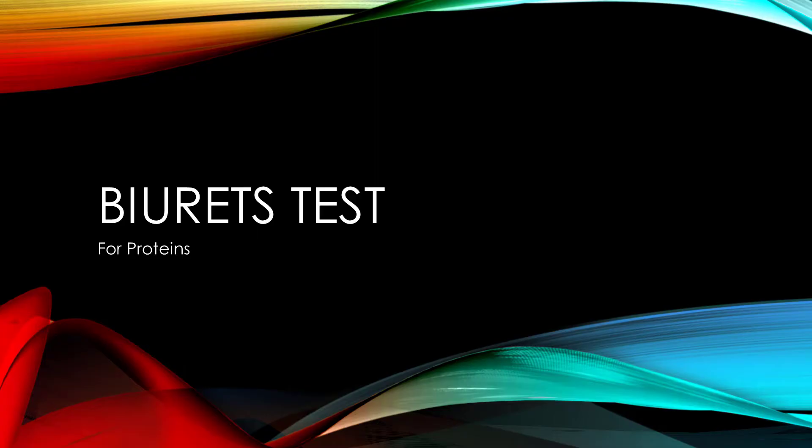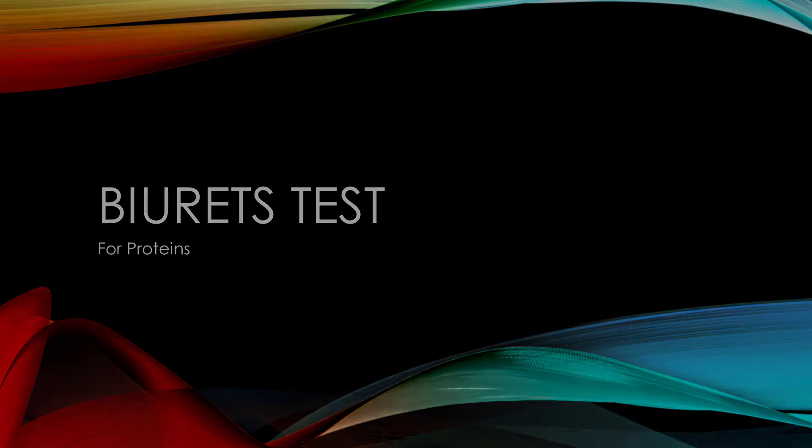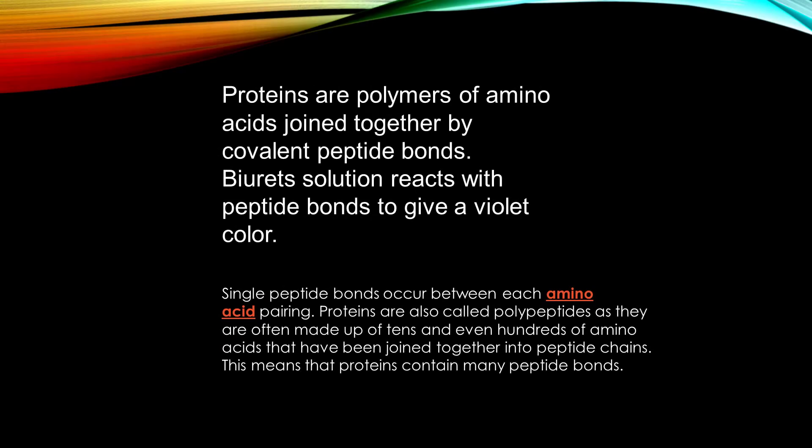Today we will be performing the Biuret test for proteins. Proteins are polymers of amino acids joined together by covalent peptide bonds. Biuret solution reacts with peptide bonds to give a violet color.